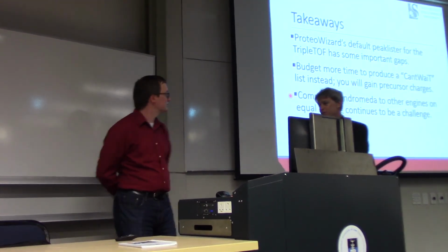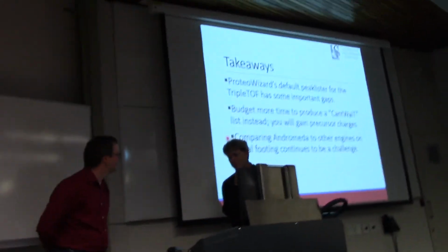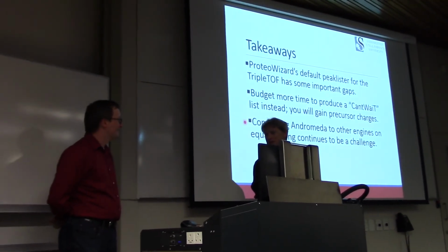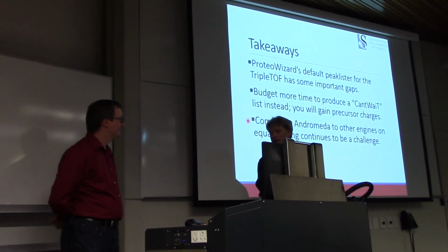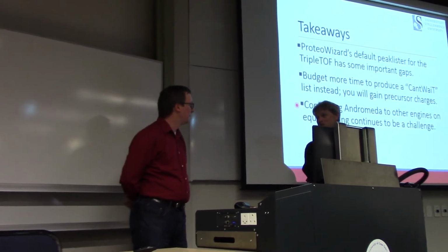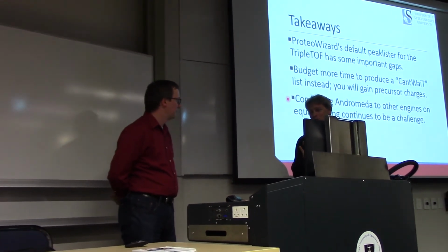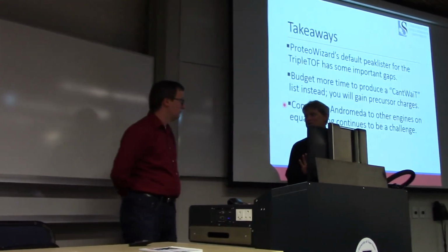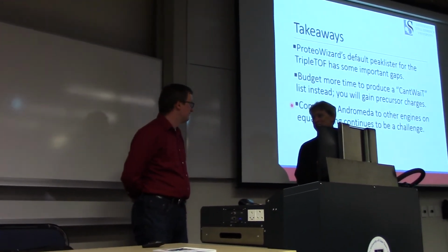So there's a chicken and egg problem here, isn't there, with spectral library deconvolution of data generation from instruments generating data on, in theory, every peptide, which has never been possible before. So by definition, we're generating spectra from peptides that nobody's ever seen before, but you need a spectral library to be able to interpret the data you've generated. Yeah.